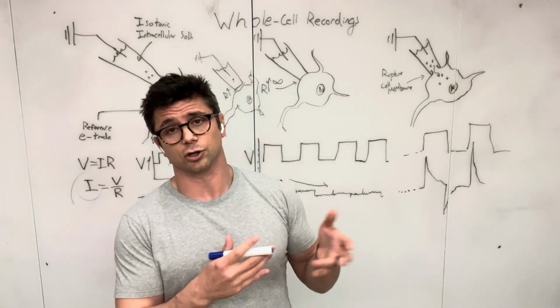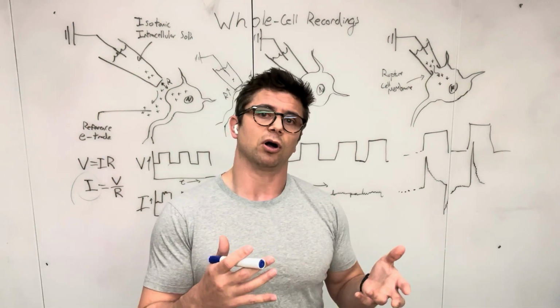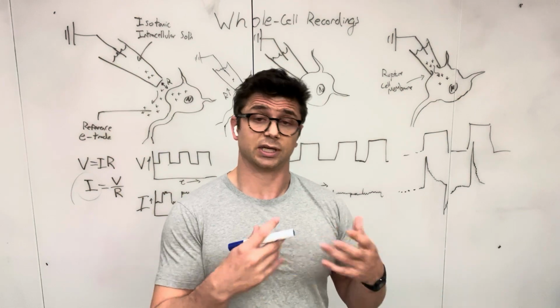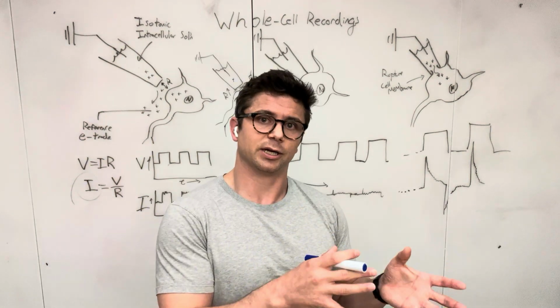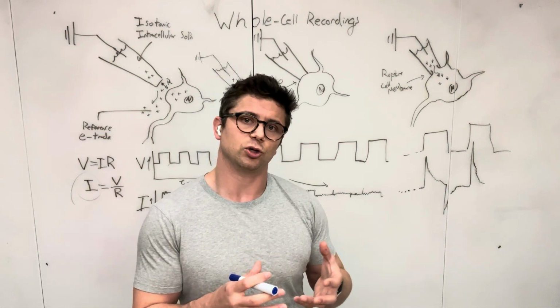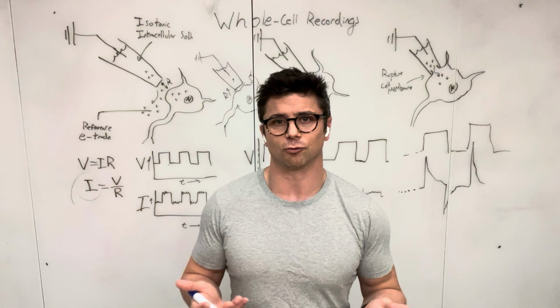You listen to the neuron doing its action potentials. You can also hear what other neurons are saying to your neuron. They'll synapse on your neuron and cause little changes in current by their neurotransmitters binding and opening little channels in the neuronal membrane. And so that's how you record from a single neuron using whole cell recordings.